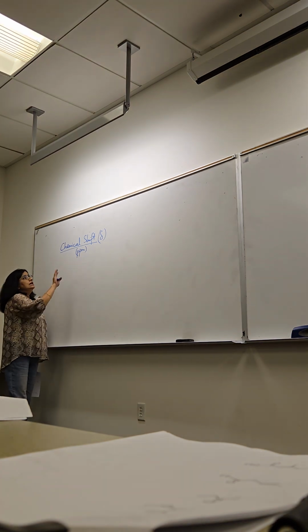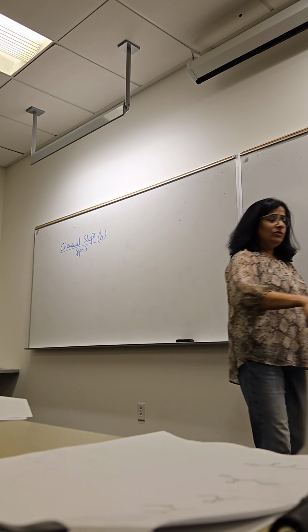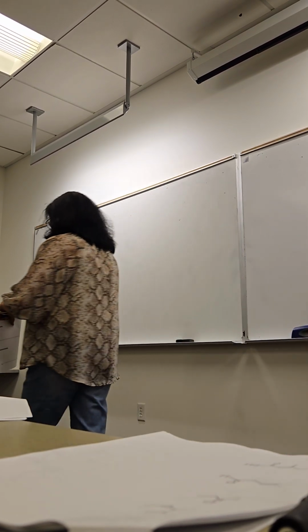But the point is, we will only use ppm. Now, unlike IR, where the signals go down, here the signals go up. So these are actually peaks.